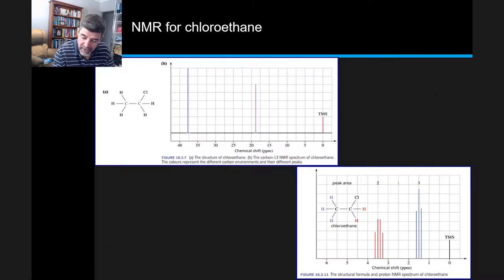You can see that there's a peak occurring here around the 1718 mark, and another one occurring up here around the 3738 mark.